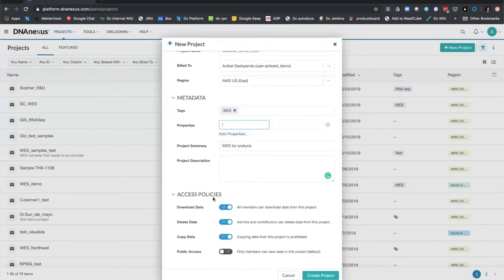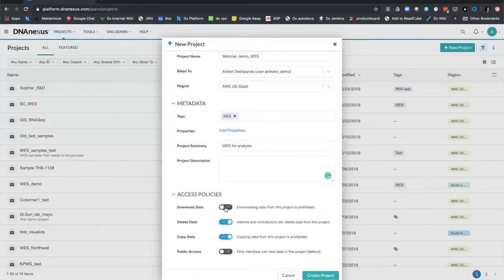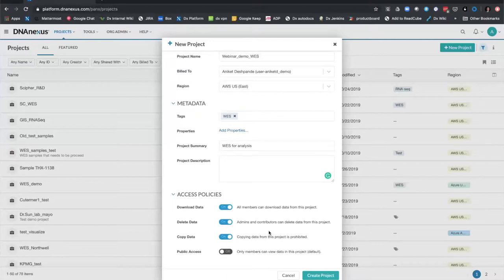Finally, while creating a project I have the option of specifying access policy privilege levels. I can restrict access to the contents of this project by toggling on and off buttons — for example, preventing users who have access to this project from downloading, deleting, or copying any data to a different project. This satisfies some of the most stringent policies, and can be enforced at the outset or at any point in the project's lifecycle if you're an admin.